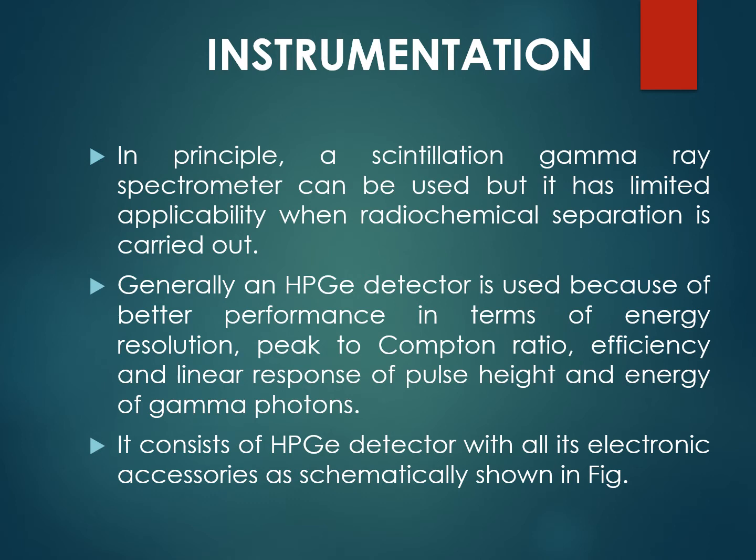And the instrumentation of neutron activation analysis involves the HPGe detector with all its electronic accessories, as schematically shown in the figure in the next slide.